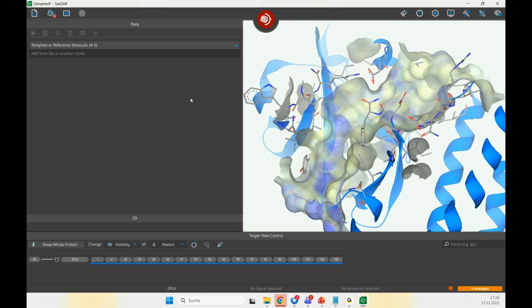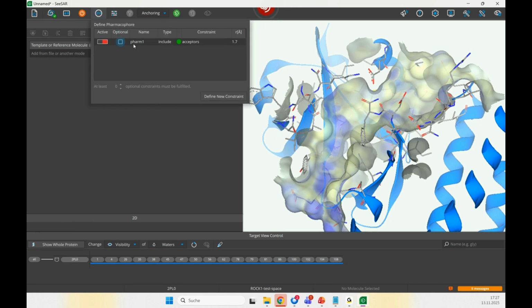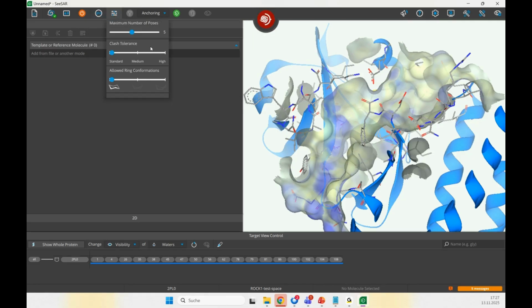So the results are now sent to St. Augustine. I can also check on the progress here. In the first step, the synthons, so basically translated building blocks where the functionalities are encoded into extension vectors, are now processed, are now docked into the binding site. And during this period, also the chemical space is ramped up.